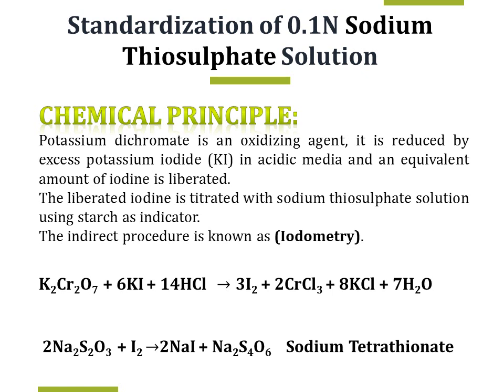هنلاحظ هنا بالchemical principle equations potassium dichromate oxidizing agent يتفاعل مع البوتاسيوم iodide reducing agent in the presence of HCl. يتحرر عندي الأيودين راح تتكون عندي salts such as chromium trichloride and potassium chloride. بعدها liberated iodine is titrated with sodium thiosulfate solution. راح يتكون عندي sodium iodide and sodium tetrathionate.